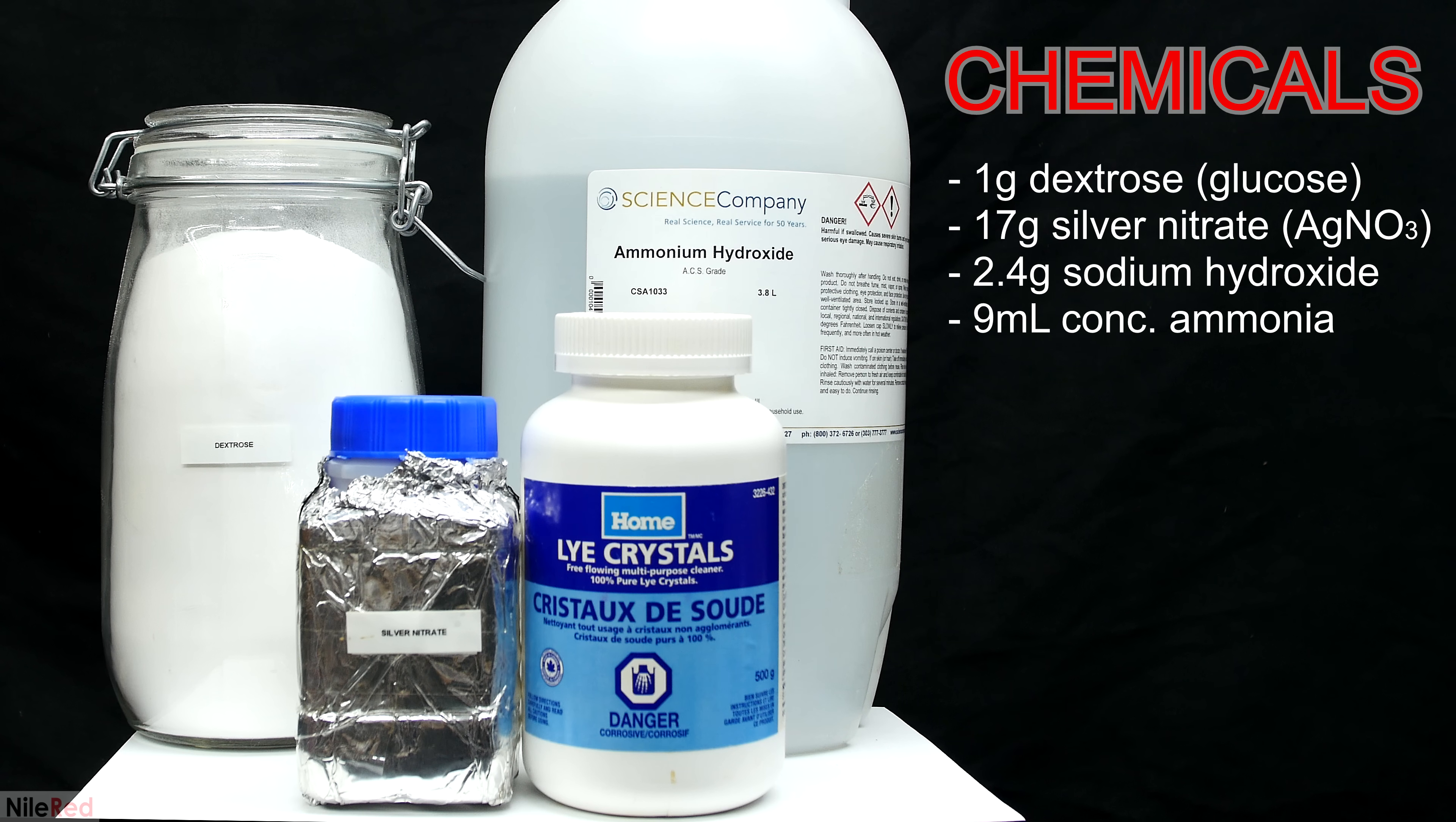The sugar and the sodium hydroxide were purchased locally, but the ammonium hydroxide had to be purchased online. Ammonium hydroxide is pretty much just super strong ammonia cleaner. It's likely that it can be replaced by the more dilute stuff you find in stores, but I've never tried it personally. It might be possible to buy the silver nitrate online, but I just made it myself by reacting silver metal with concentrated nitric acid.